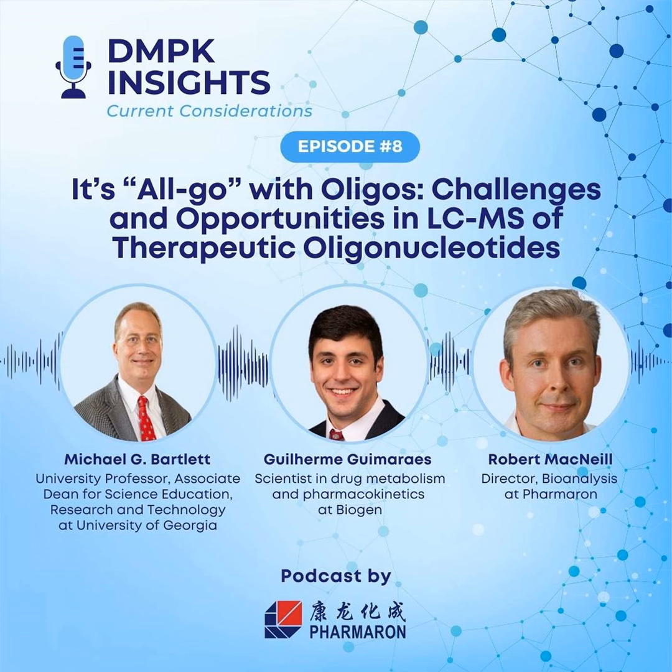There's some interesting hardware coming out. We got to work with one of these where you're able to incorporate a multi-emitter into your mass spec, with the idea being that you get microflow LC and nanoflow electrospray into the mass spec, to improve again an extra improvement of your sensitivity, to try to recover some of that sensitivity loss.